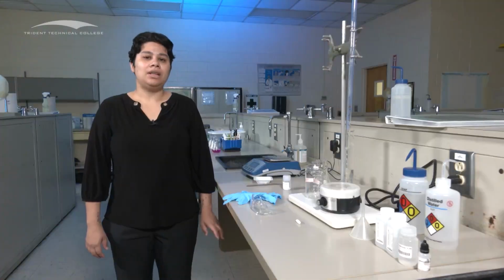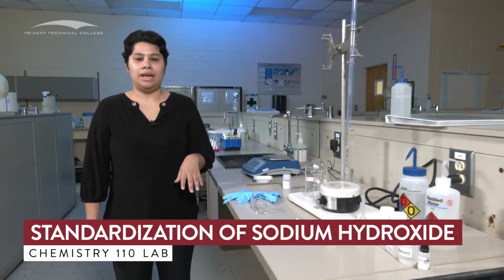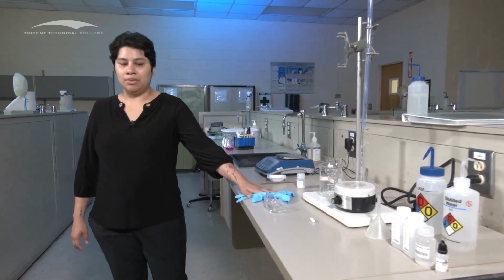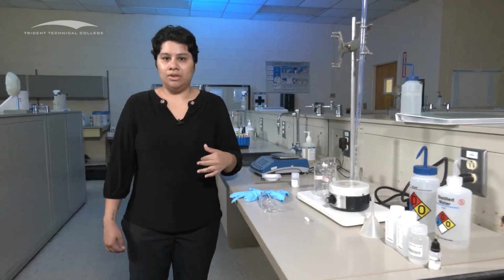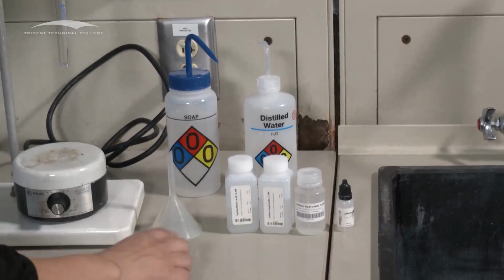Hi, guys. For this lab, we're going to talk about the first titration, which is the standardization of sodium hydroxide with KHP. For this lab, there's a couple of things that you're going to need, very, very specifically, very, very important. You're going to need gloves, and you're going to need goggles, of course, and then make sure that you have your closed-toe shoes and long pants on. You're going to need your phenolphthalein indicator, sodium hydroxide and hydrochloric acid.